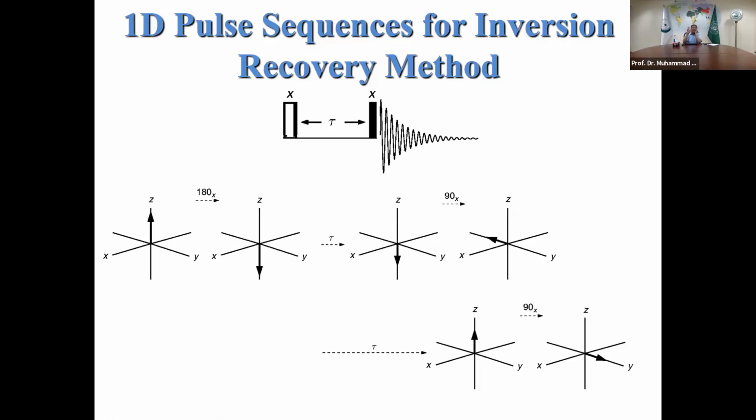And during this time, you should now understand why it is important that NMR is multi-pulse. And second, now you can see the position of these vectors on the XY plane, and with time they're inverting back to the positive point.